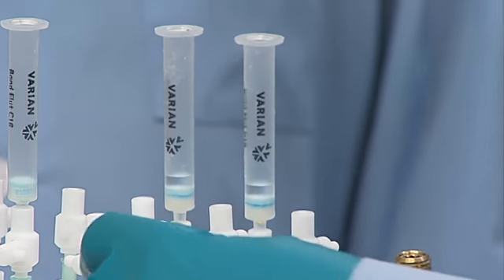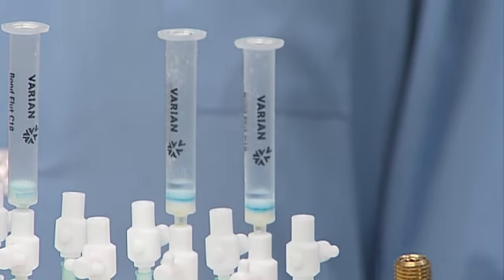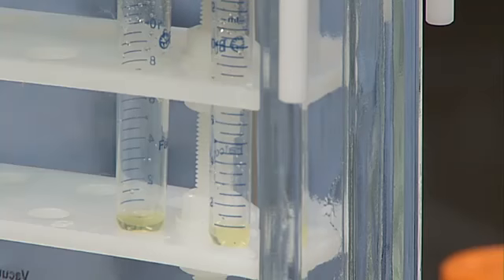If additional optimization is needed, there are 2 common parameters that can be optimized: solvent strength and pH. Basically, you want to wash with the strongest solvent possible, removing interferences without eluting your analytes of interest. pH can also facilitate the removal of interferences and in turn offer a much cleaner extract.